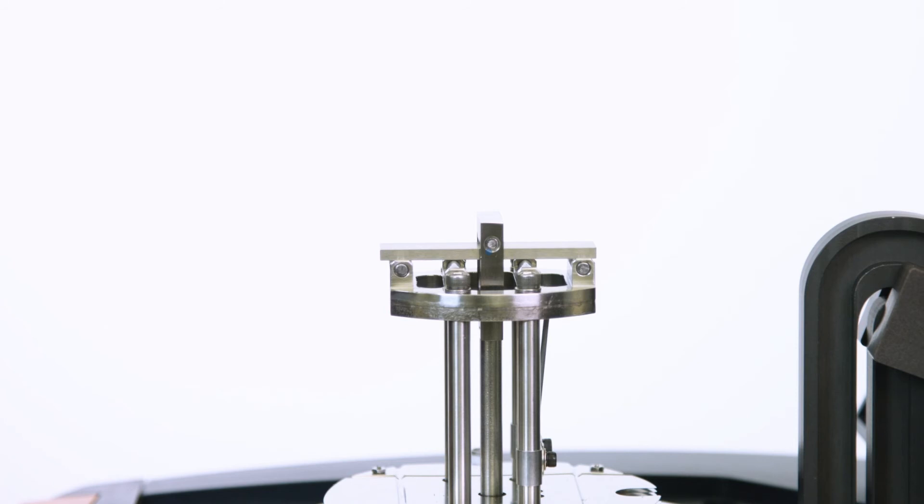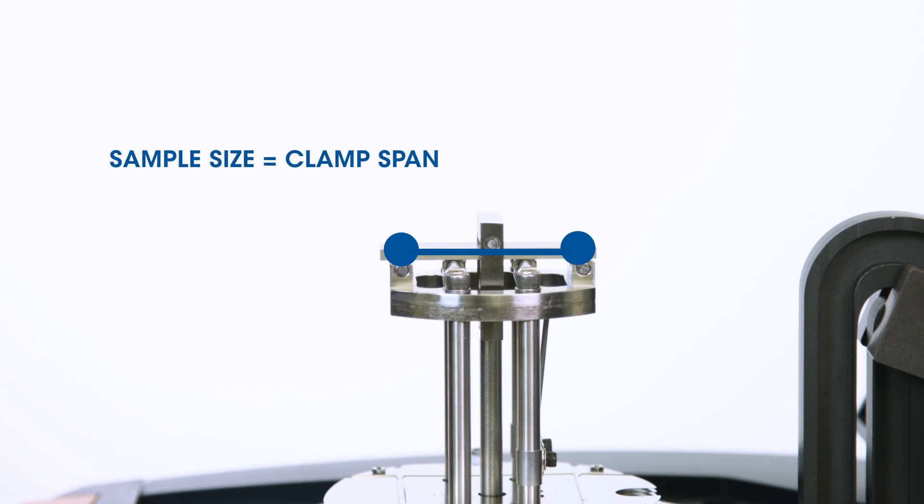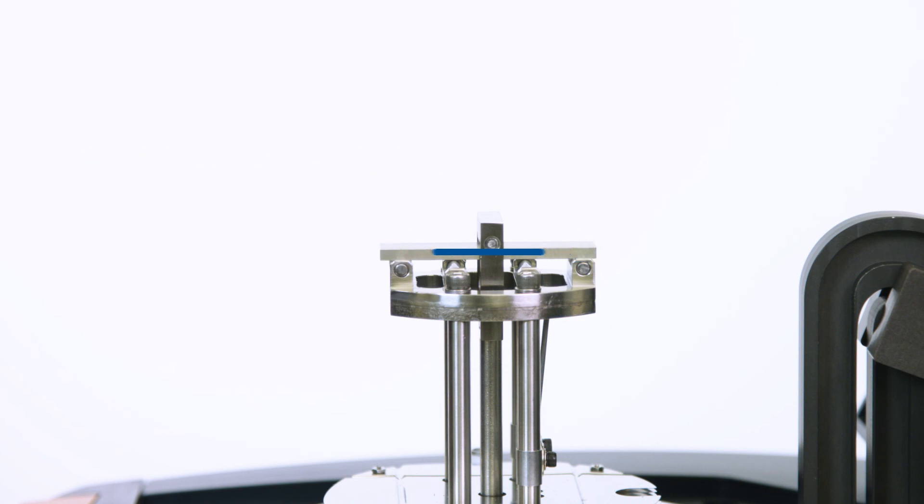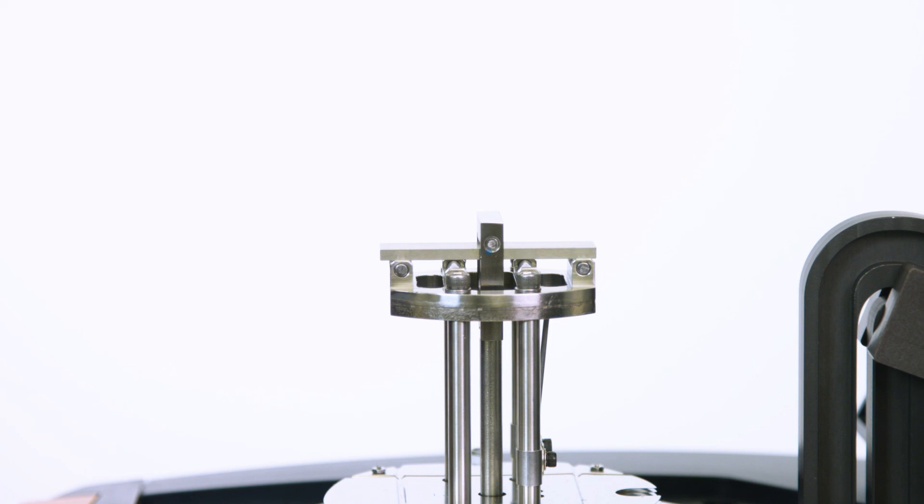Please note that when using a three-point bending clamp, the sample length is the span of the fixed clamp. For example, when you use this 50 millimeter clamp, the sample length is fixed at 50 millimeter. You can always install and calibrate some smaller size three-point bending clamps for testing shorter samples.